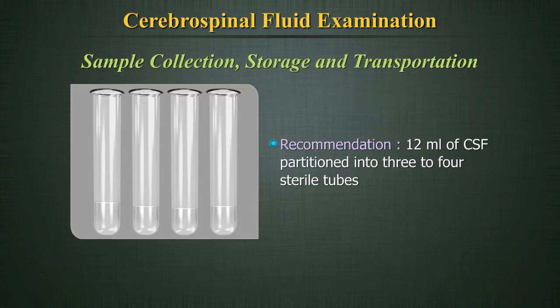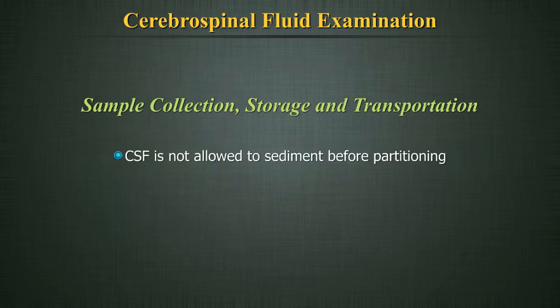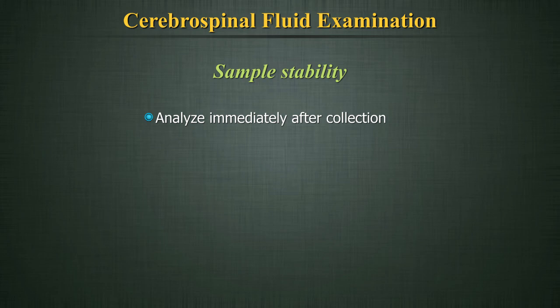Recommendation regarding CSF partitioning and storage states that 12 milliliters of CSF should be partitioned into 3 to 4 sterile tubes. It is important that the CSF is not allowed to sediment before partitioning. Sample stability: CSF should be analyzed immediately, that is, less than 1 hour after collection.